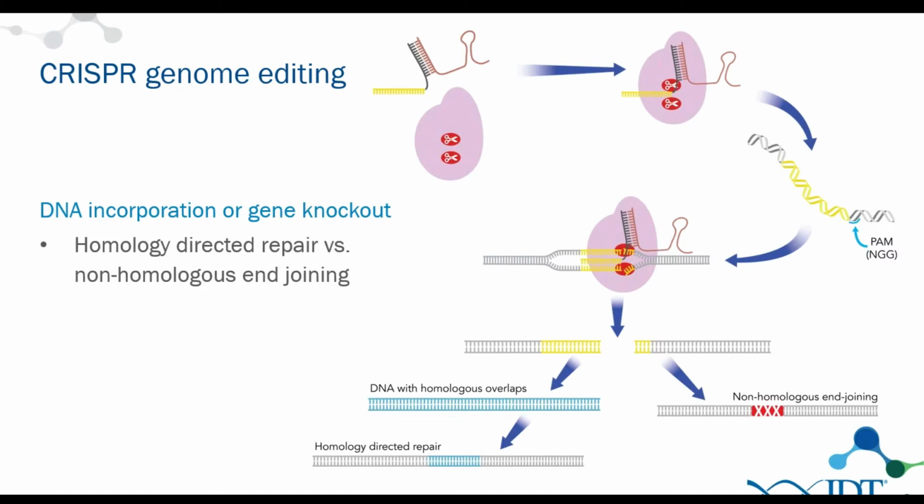Another interesting pathway uses homologous recombination, where you provide some donor DNA which has overlapping sequences to the site you want to cut, and through this mechanism you can integrate this donor DNA into the genomic DNA of your cell. This is a seamless integration, so you can have from a few bases, for which you could use a long oligo, like the Ultramer oligos that we have available, or it can be a complete pathway, which is a little bit trickier because you need slightly longer overlaps.